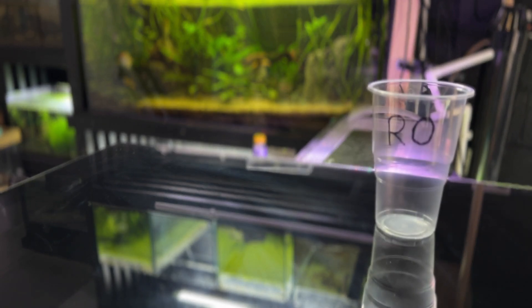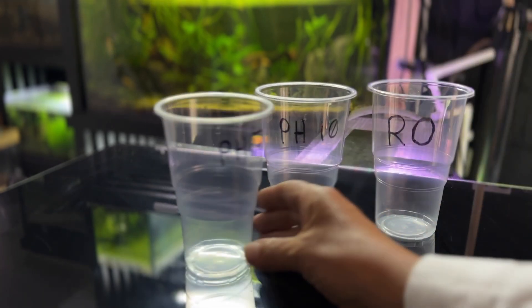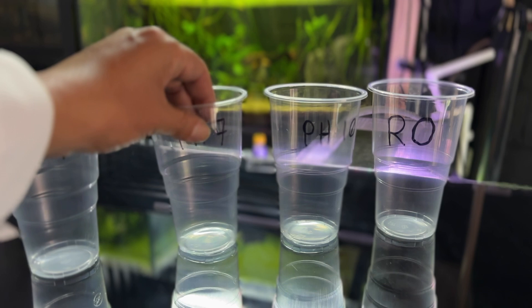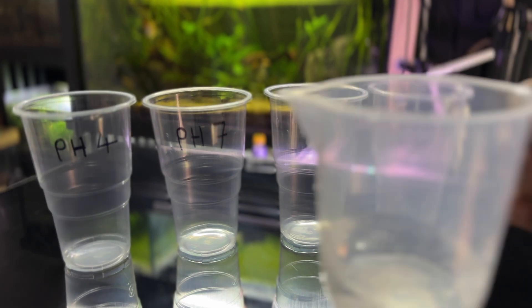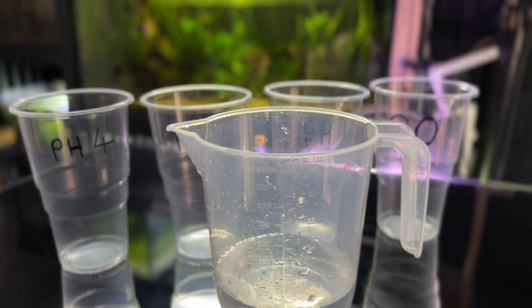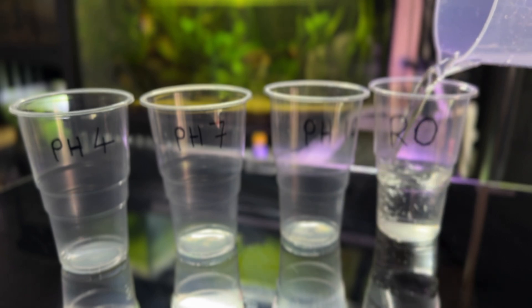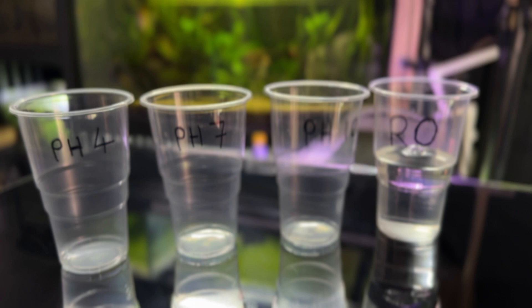First up we'll get some cups out of raw water — that's the sample for pH 10, pH 7, and pH 4. We need 250 ml in each one. I'm using RO water instead of distilled water; it does say to use distilled.